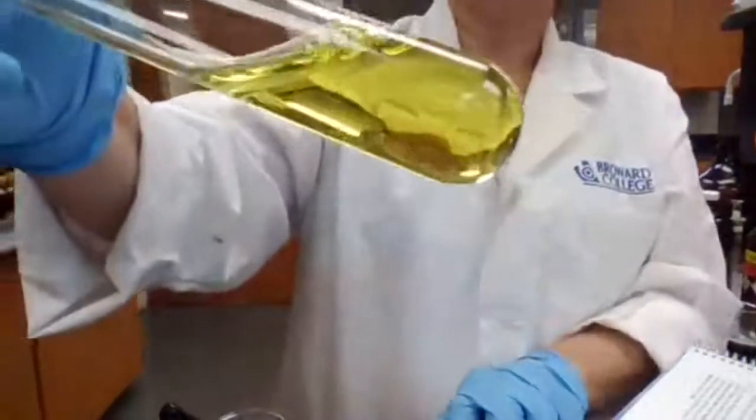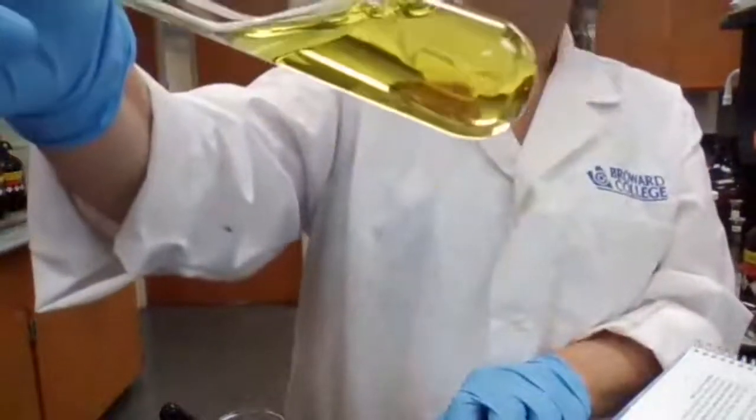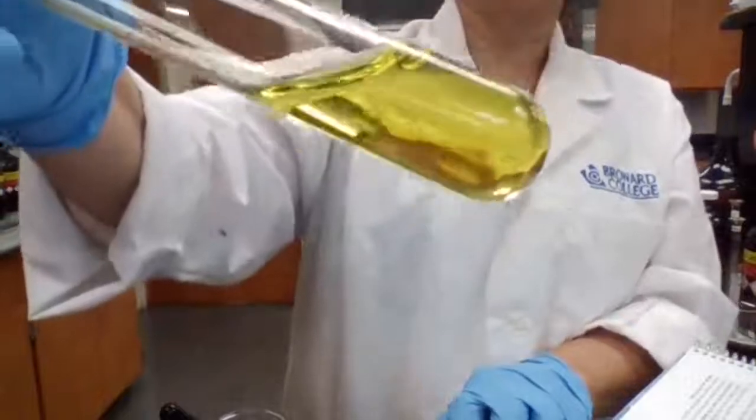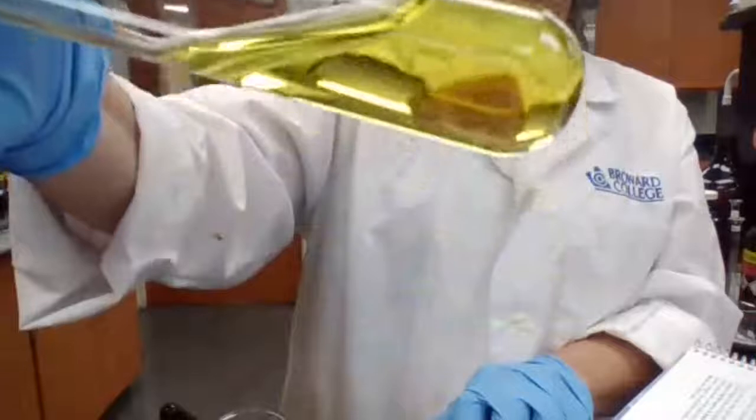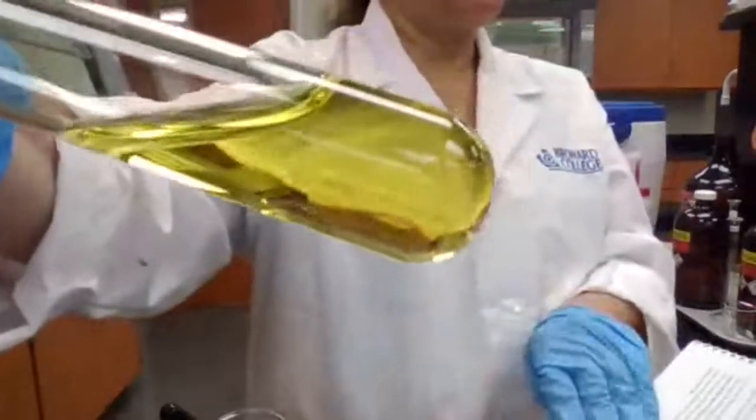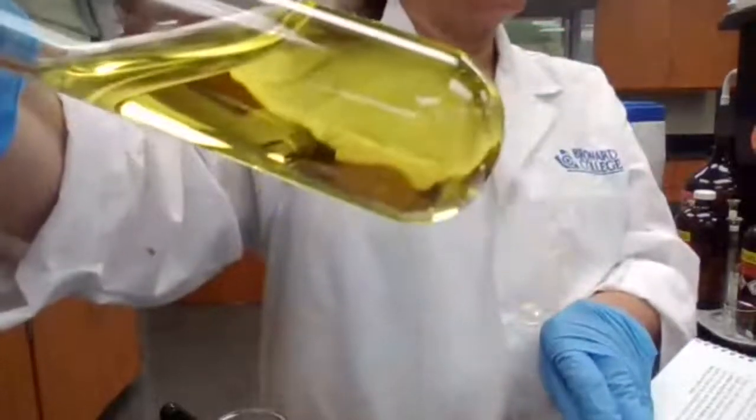Record the new color. This is after addition of sodium hydroxide.